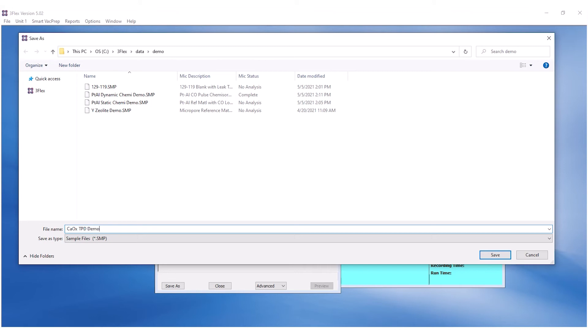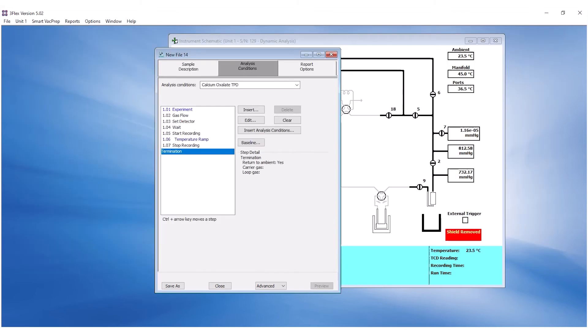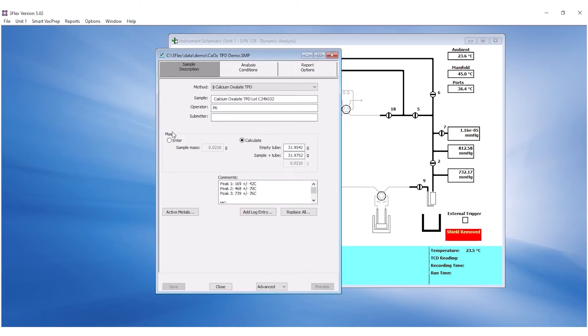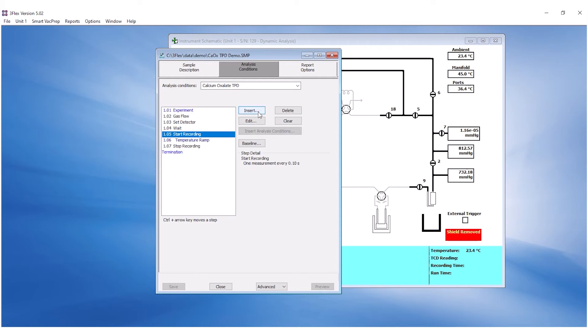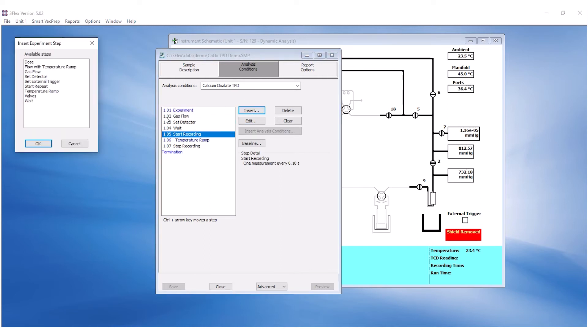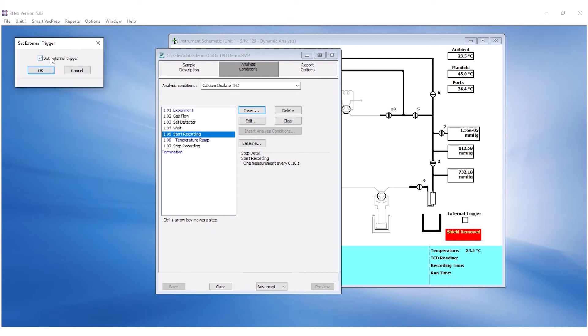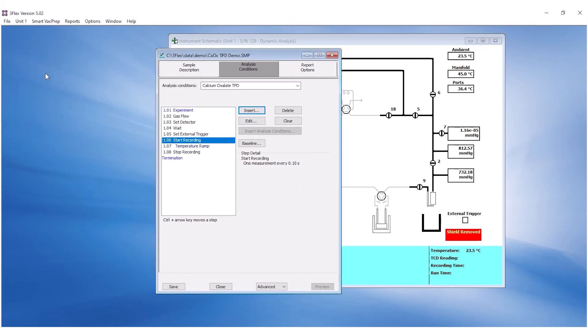If you are using the mass spectrometer, additional steps need to be inserted to trigger it. To insert any additional step, highlight an existing step and click on Insert. This will add a new step above the highlighted one. Highlight Start Recording and click on Insert to insert Set External Trigger. Ensure the box is checked and click OK.